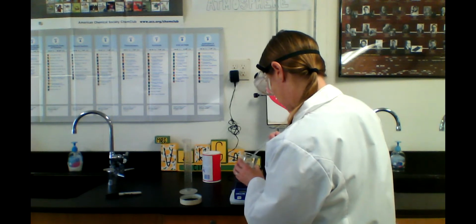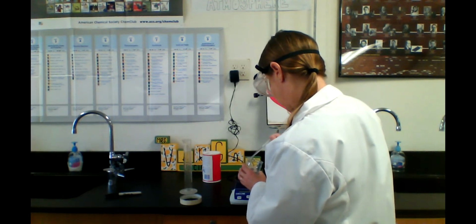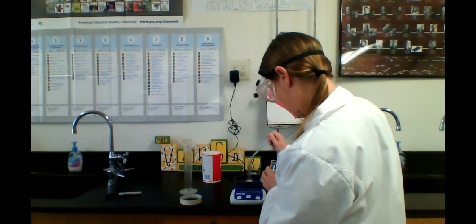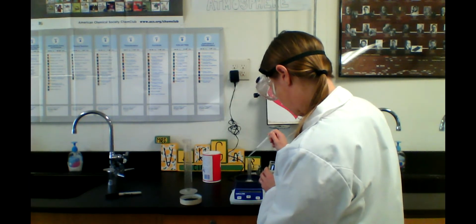2, 3, 4, and 5. Okay, now if you guys noticed, I got 1 drop onto the balance. That is a mistake. That is not a random error. That is totally fixable. In fact, I wasn't going to fix it, but I am. It's the perfectionist in me, so I'm going to wipe this off.